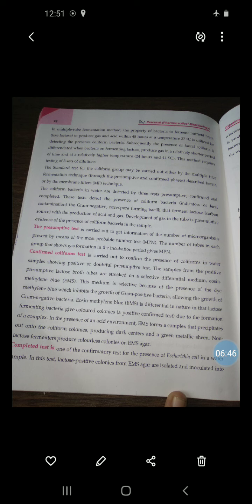This medium is selective because of the presence of methylene blue, which inhibits the growth of gram positive bacteria and allows the growth of gram negative bacteria. This eosin methylene blue, that is EMB, is differential in nature in that lactose fermenting bacteria give colored colonies. That is a positive confirmed test, due to the formation of a complex.